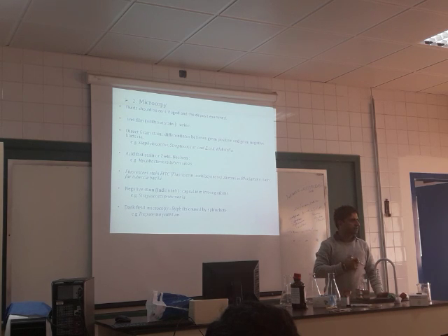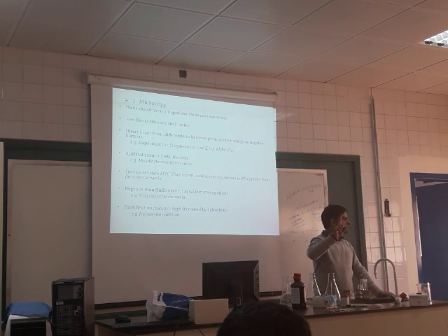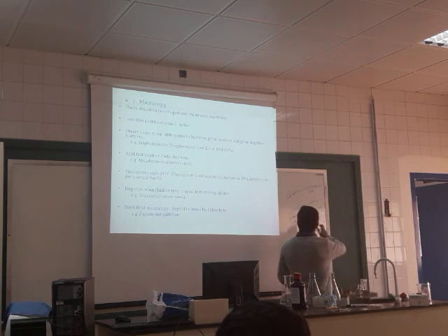First you use heat. What kind of chemicals do we need in the Gram stain? We need alcohol. We use four.